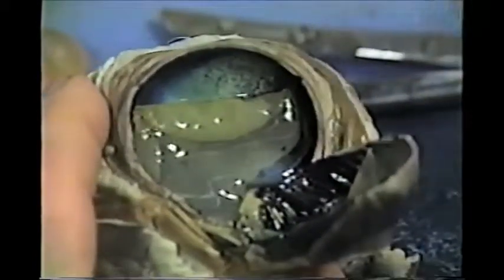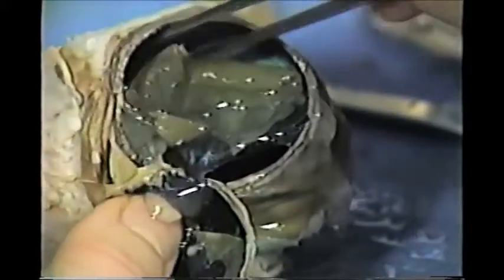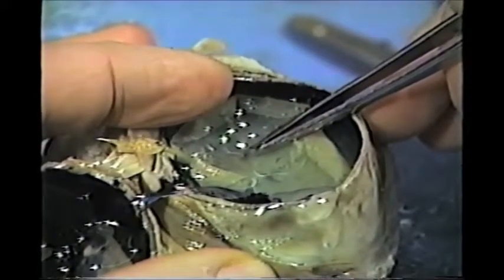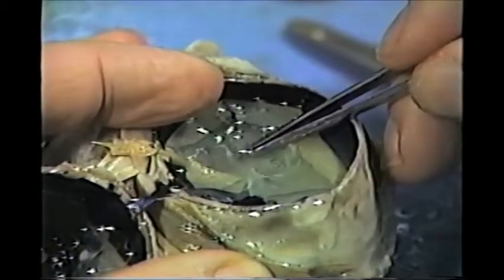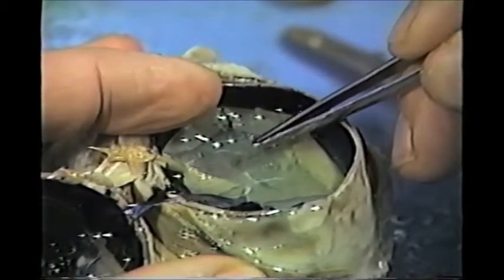If you take a look at the back of the eye, this paper-thin layer is the retina — the nervous layer of the eye that has the rod and cone cells for vision. You can see that the retina comes off very easily in a preserved eye. Right there is a point where the optic nerve leaves the back of the eye — that's the blind spot. There are no rod or cone cells there, so there is no vision there. There's also an exercise in today's lab to help demonstrate the blind spot.